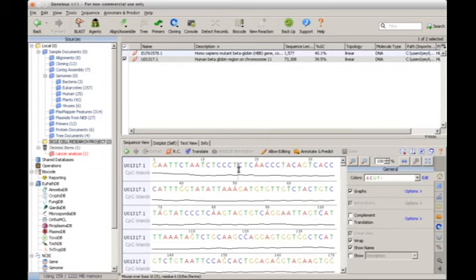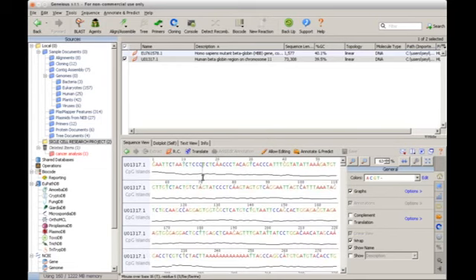As you can see here, kind of high. So this graph is trying to make you understand the stability of each nucleotide sequence. So G is there, so as you can see, the graph is high here. C is high in this place. This place is extremely low, right, because of the T. A little bit high because of the C, low, high, high, low, low, high, high. As you can see, it keeps going just like that. So that is the essence of the graph.